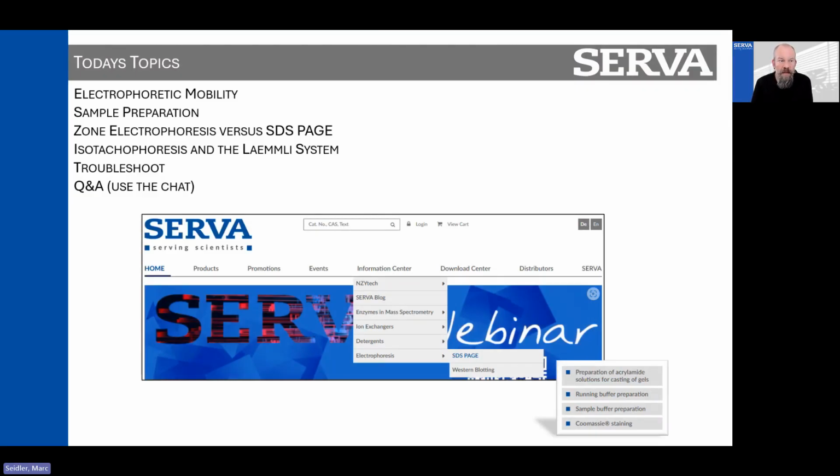First, we will talk about the electrophoretic mobility, sample preparation, then the big difference between zone electrophoresis and SDS-PAGE, and we talk about isotachophoresis and the Laemmli system itself. This leads to a troubleshooting section and the Q&A at the end.